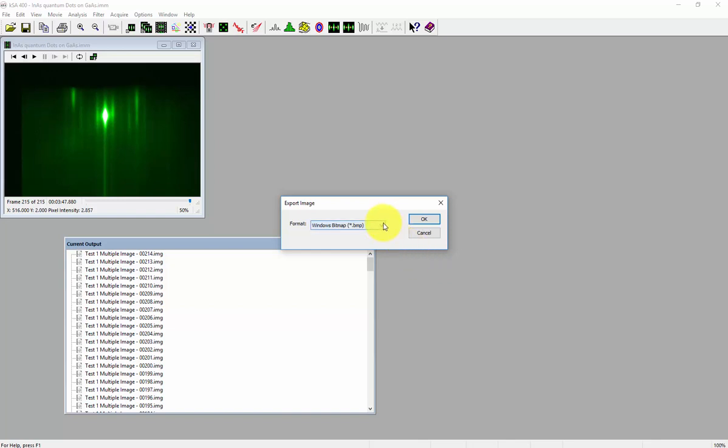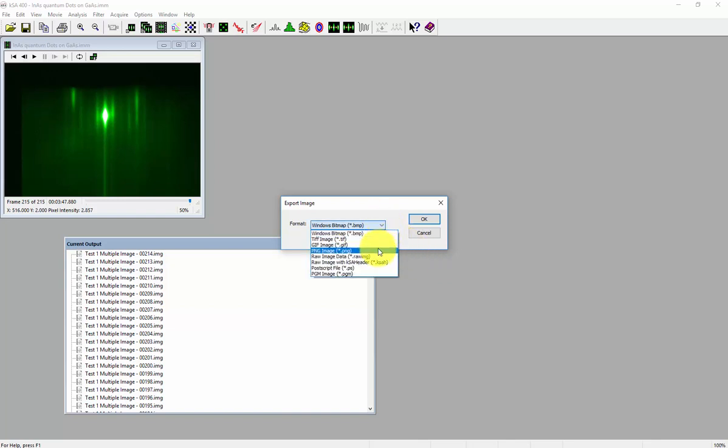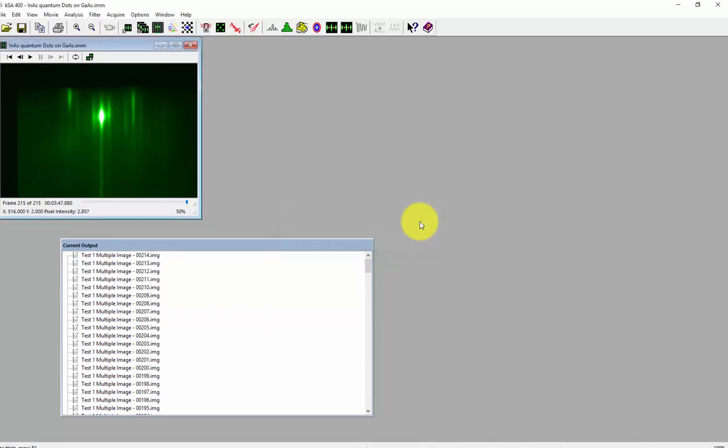A new export image window will pop up. Select the format or file type that you want to export as and click OK.